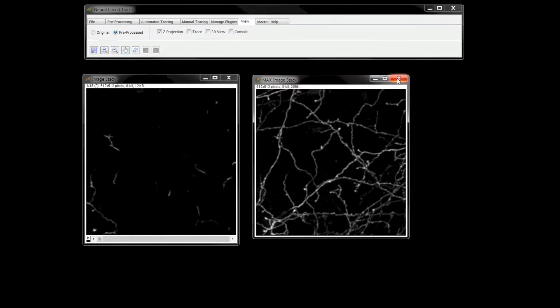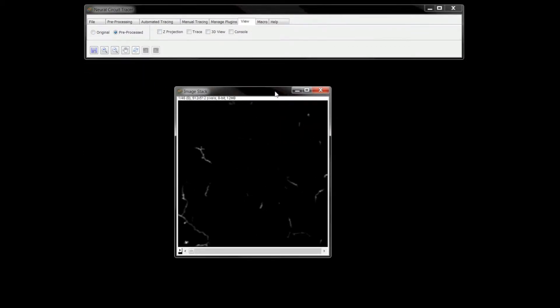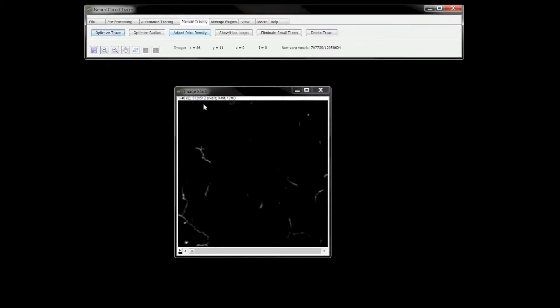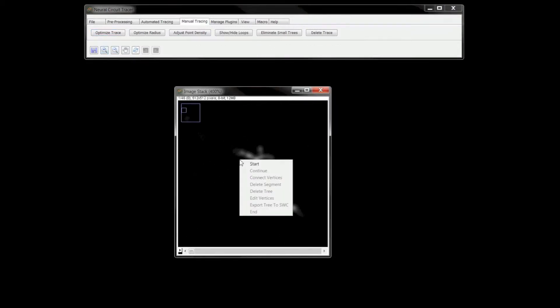Neural Circuit Tracer provides a convenient way to manually trace structures on the image stack. Let me demonstrate this functionality by zooming into a small part of the stack and placing vertices as I navigate through it.